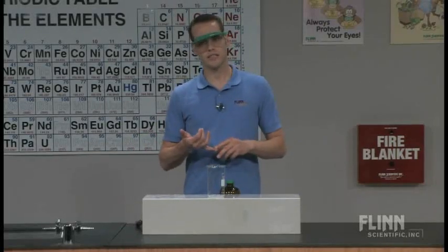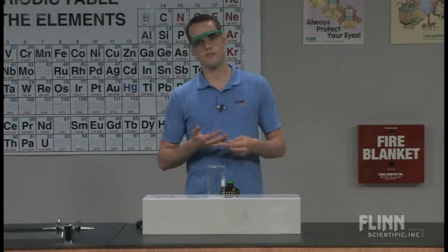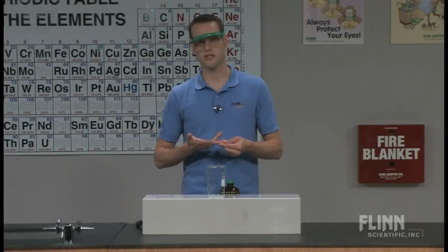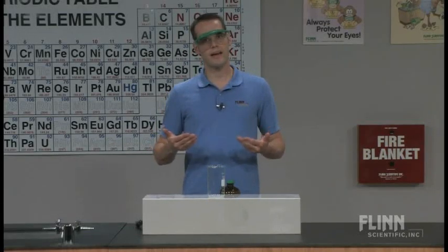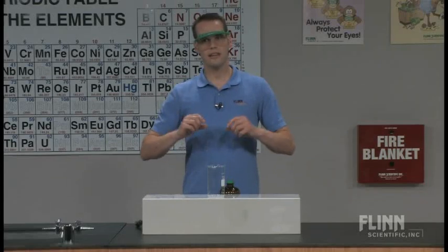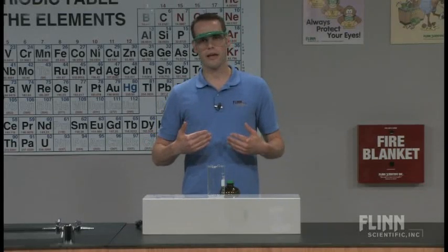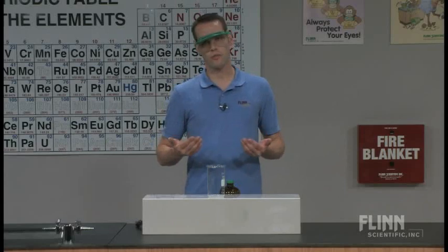So you can tie this into either unit: oxidation and reduction, the activity series of metals, or into your classes of reactions unit. But it's a really dramatic reaction to look at and let students see something they don't normally think, which is that metals can also form crystals.